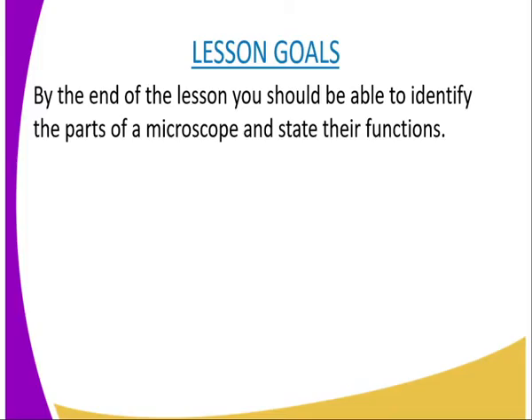We are going to have the following lesson goals, whereby by the end of the lesson, you should be able to identify the parts of a microscope, and also state the functions of the parts that you have named.